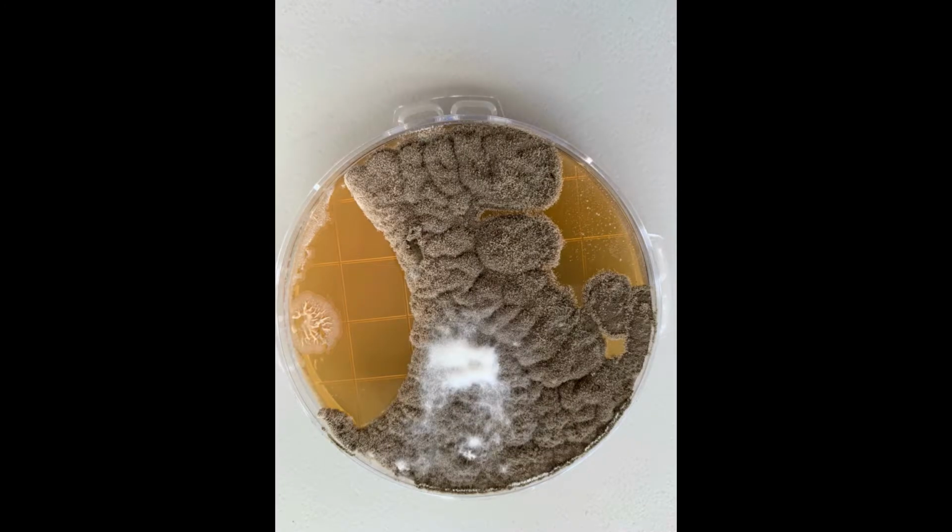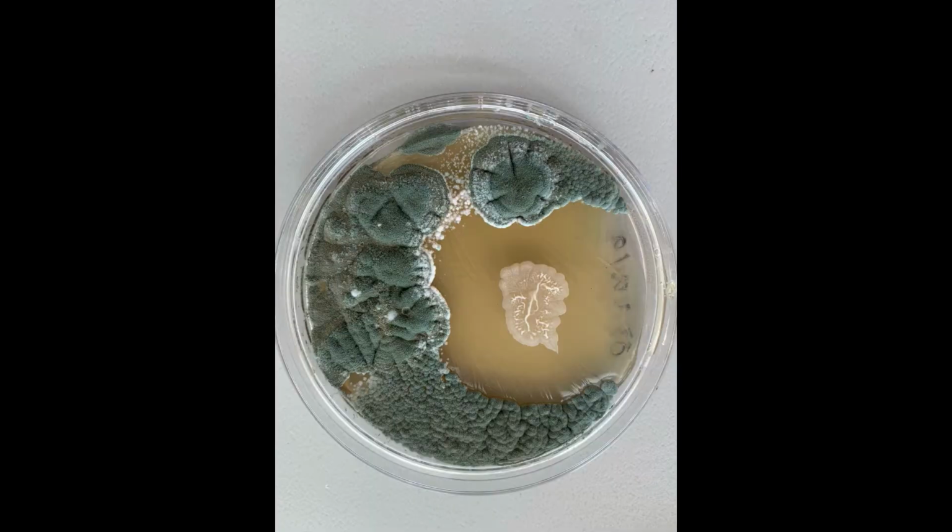I really couldn't resist, and I actually had to inoculate that yeast and also the mold, just to see in a plate what exactly happened, whether it just happened in this plate, or whether this yeast is actually producing an antifungal agent. Here you can see the original plate. Now you're going to see the difference in color. This is a very old plate, but it used to be the same color. As you can see, this one is very green.